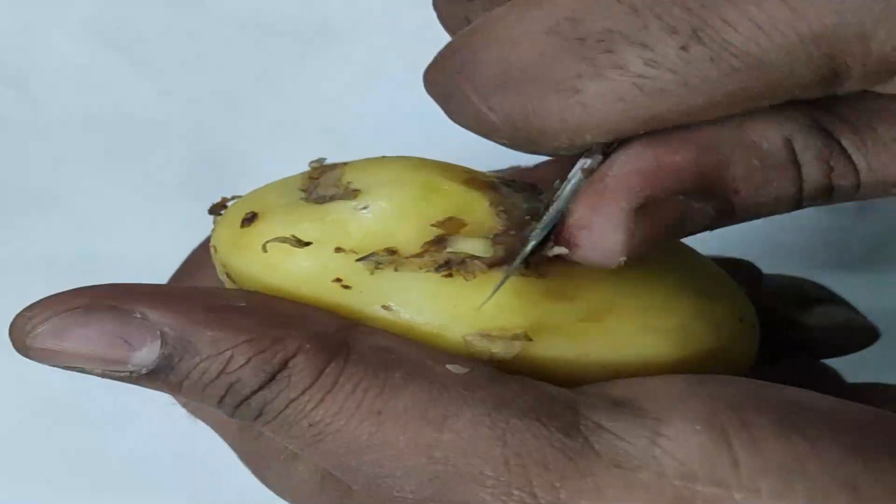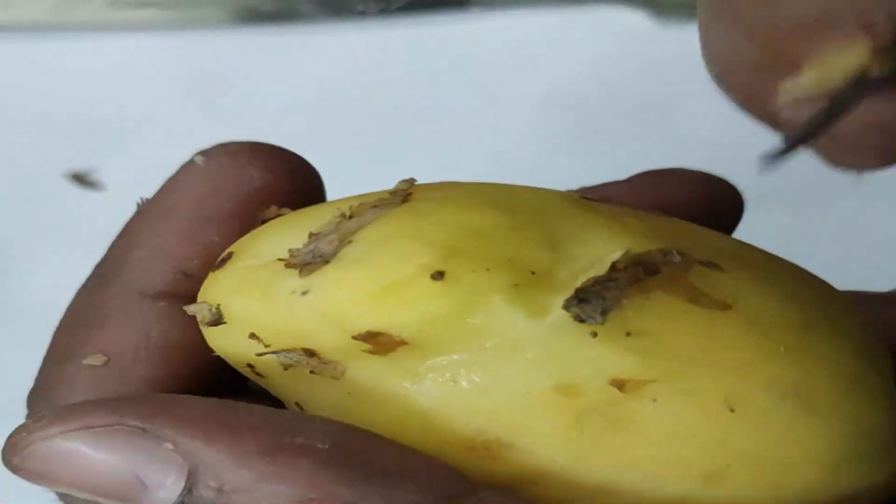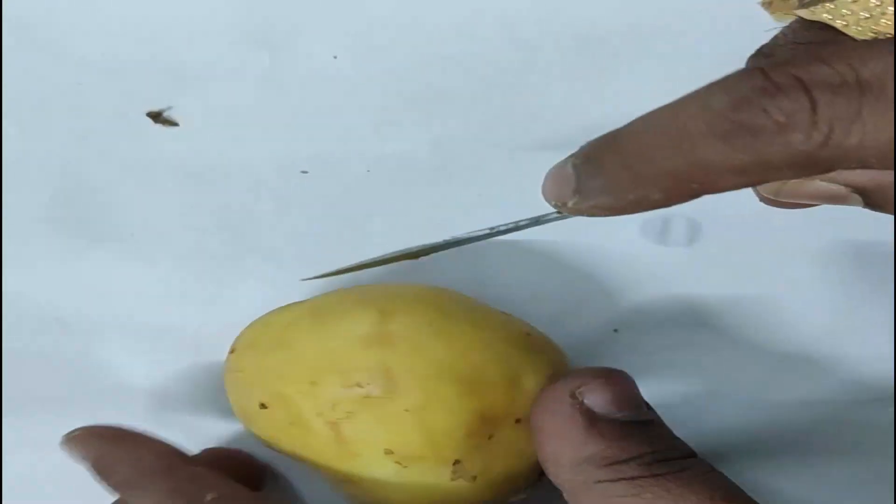If we keep the skin, it will not be permeable to water molecules travelling inside the potato. So it is very important to discard the skin of the potato; otherwise it will not act as an osmometer.